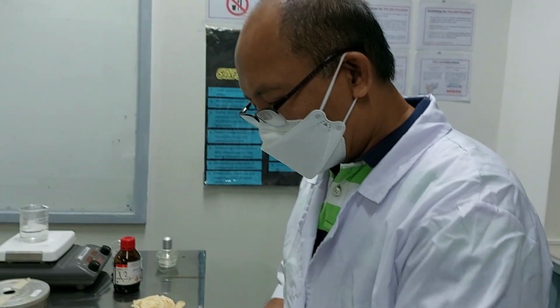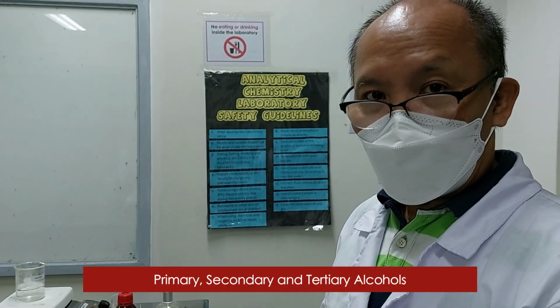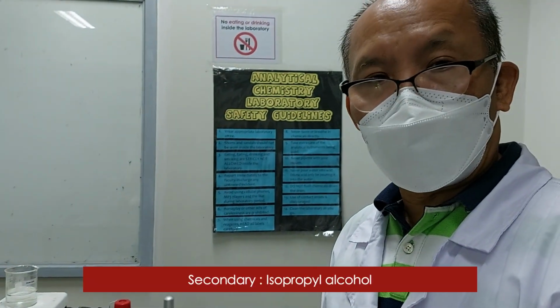Now let's go to test for alcohols. We classify alcohol, remember class, as primary, secondary, and tertiary alcohol. An example of primary alcohol is ethanol. Secondary alcohol is isopropyl alcohol, and of course you have tertiary butyl alcohol. So how are these three alcohols differentiated?